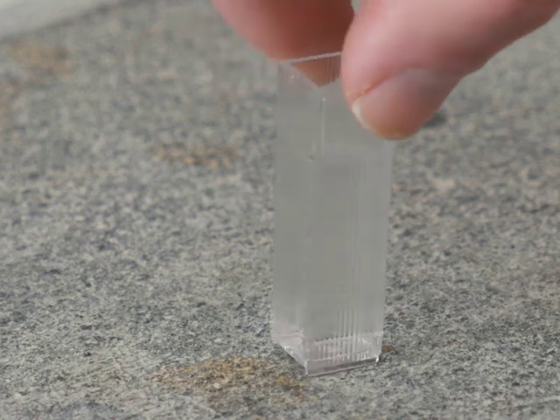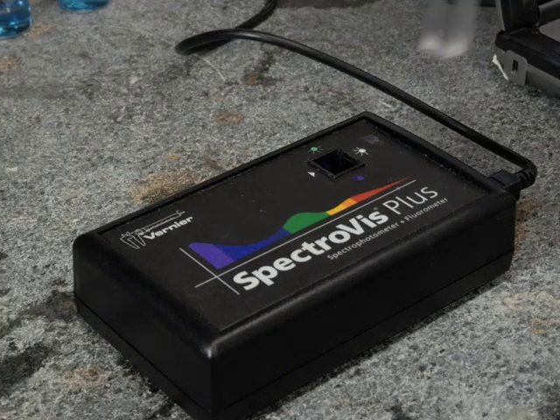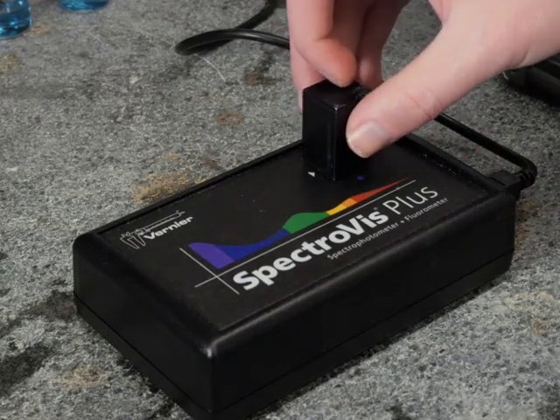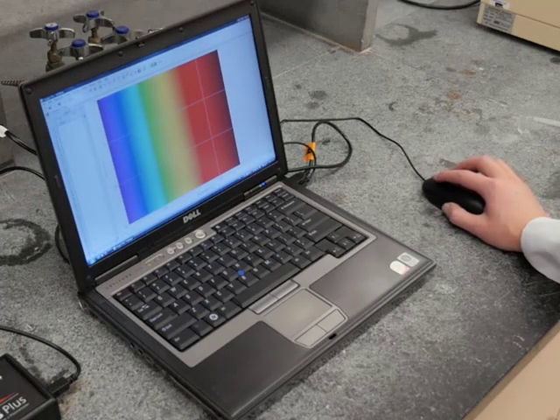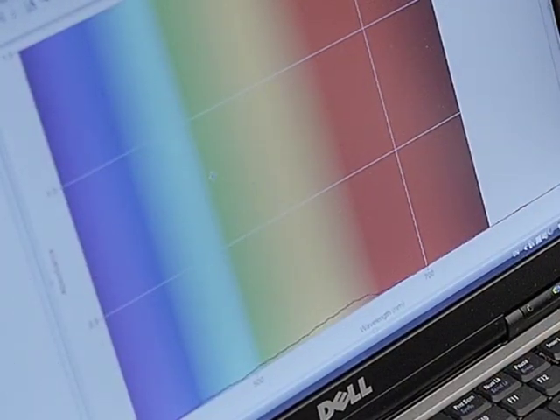Ensure that the cuvette is aligned properly with any grooved sides out of the beam path and insert it into the spectrophotometer. Secure the lid to prevent ambient light from entering the system. Measure the absorbance of the blank at 1 wavelength, or over a wavelength range. Record or save the absorbance, as it must be subtracted from the absorbance of the sample.